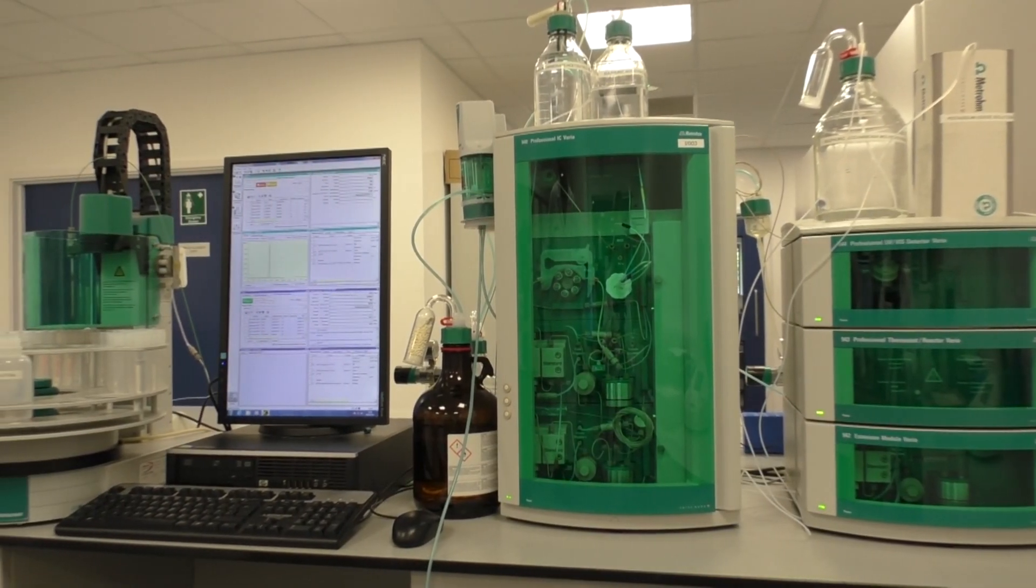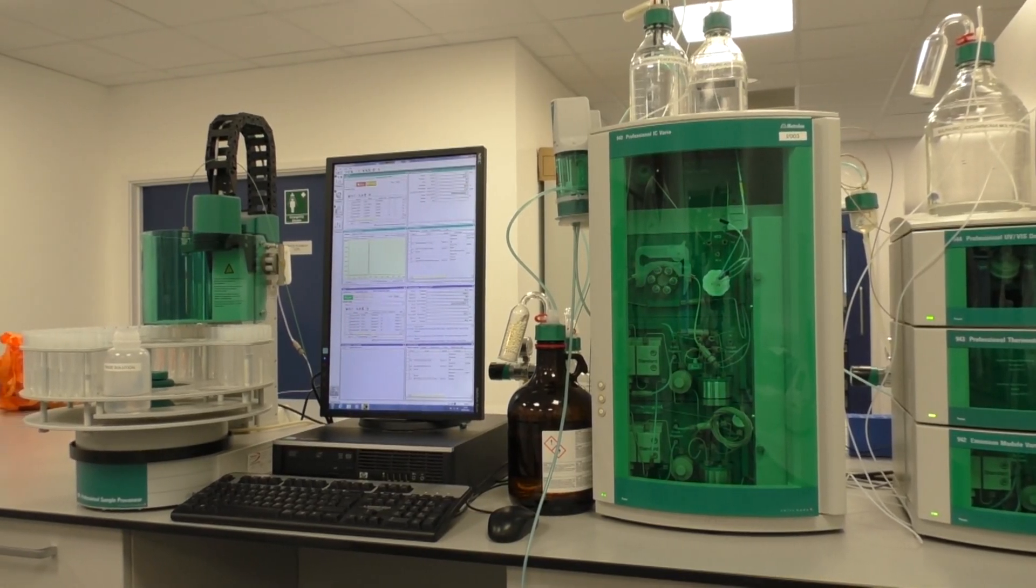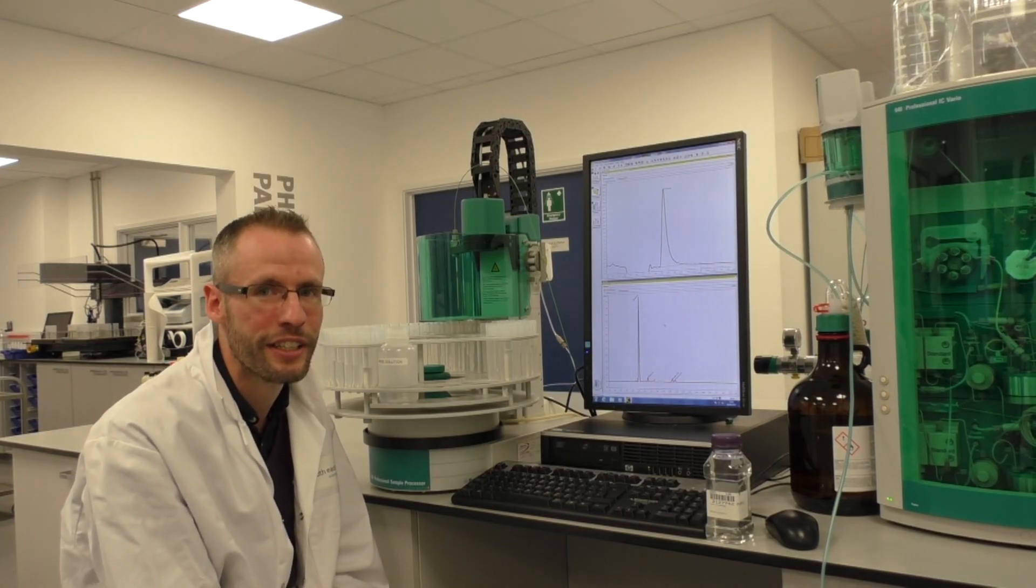We run it for a range of different methods. We have a setup for a bromate method using a post-column reagent and our normal oxyhalide methods currently analyzing fluoride, chlorite, chlorate, and bromide.